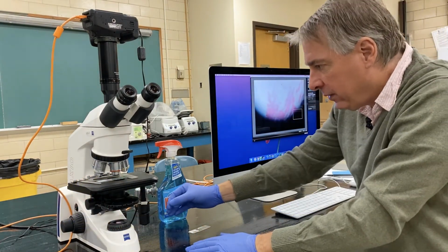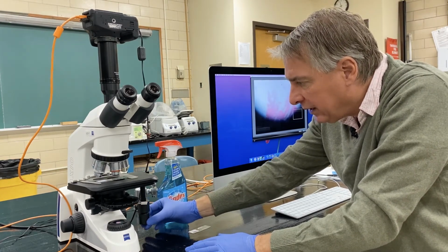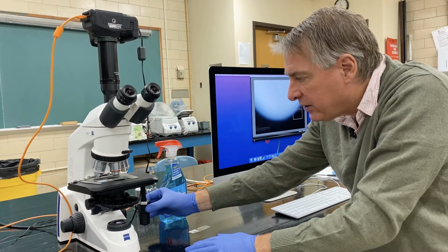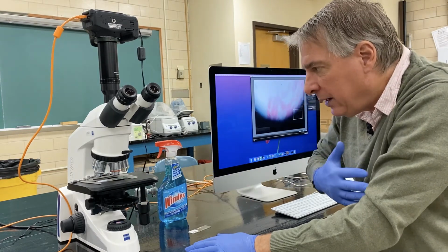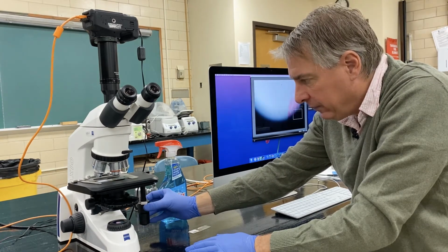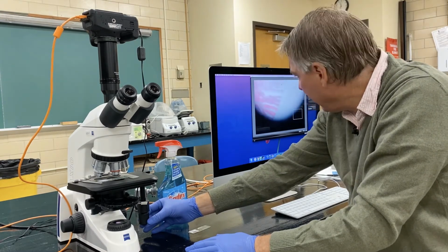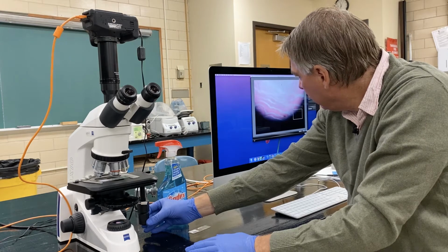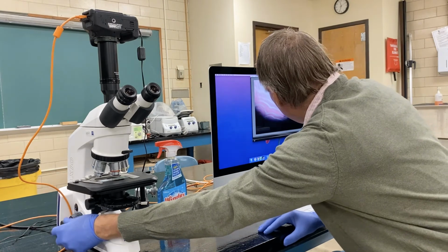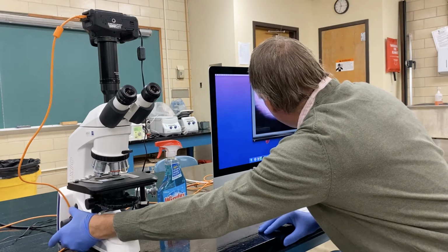We can move the slide and the slide holder with this articulating arm that has 2 turnable knobs on it. The top one moves the slide towards me or away from me, and the other moves the slide left and right. So you can maneuver the slide on the stage and find your sample. I'm first going to try to focus my sample with the coarse and fine focus knob.